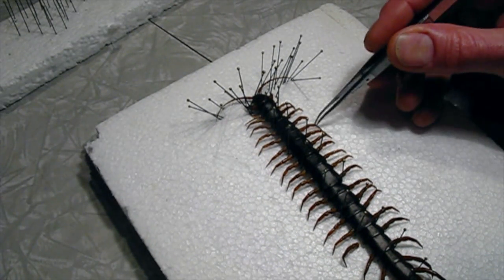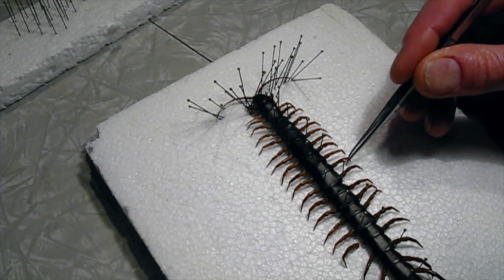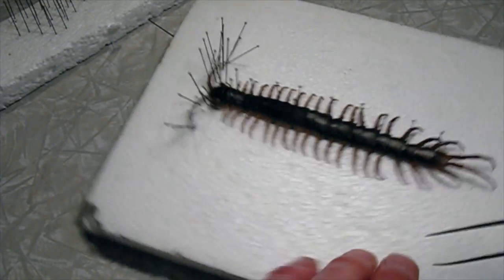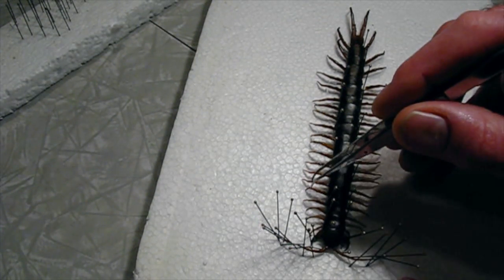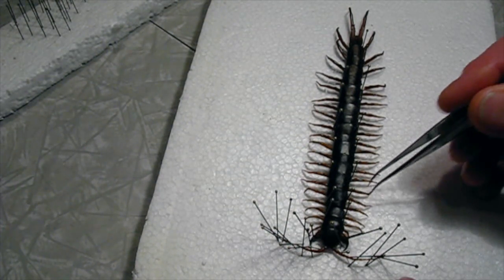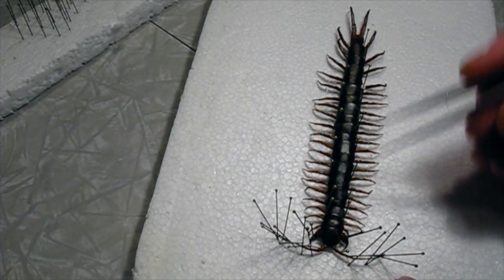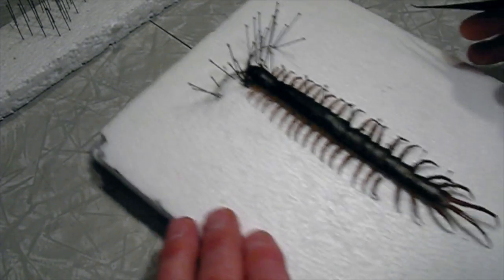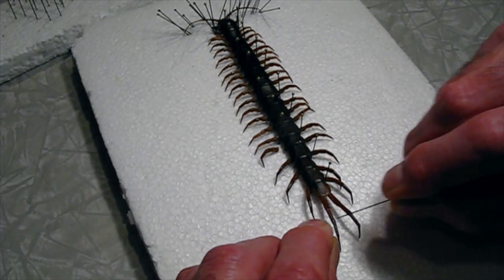I think in this case I'm just going to have them all out fairly even, just because this is going to be part of the Portland Insectarium's display collection, and people can see all the legs. It's kind of fun too, because people think a centipede has 100 legs, and none of them have 100 legs. It just means a lot. They have 42 legs, and then some other species, genera, families even, maybe the soil centipedes have more than 100 legs, but I believe most all of them have 42. So I'm just placing each individual leg to try and get it fairly straight, not completely stretched out, so it's got a little bit of curve to it. Gives it the feeling that there are muscles in there, active in there. And then on the back end, we'll take a few pins here and maybe prop up. They've got these very large legs in the back.